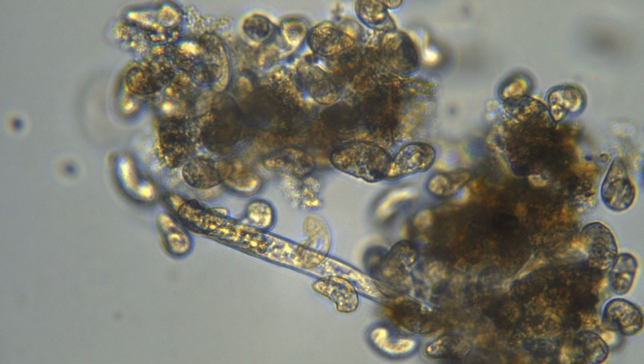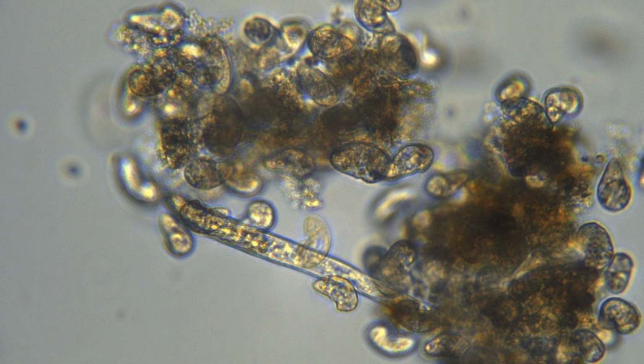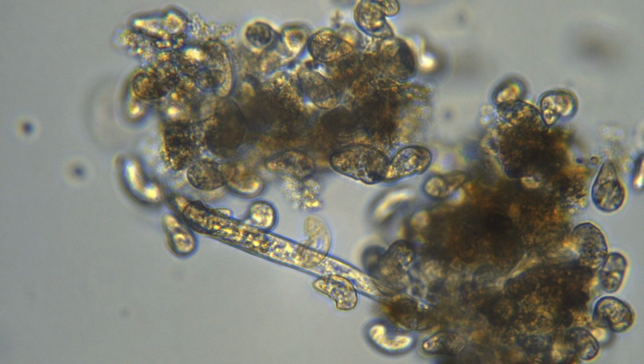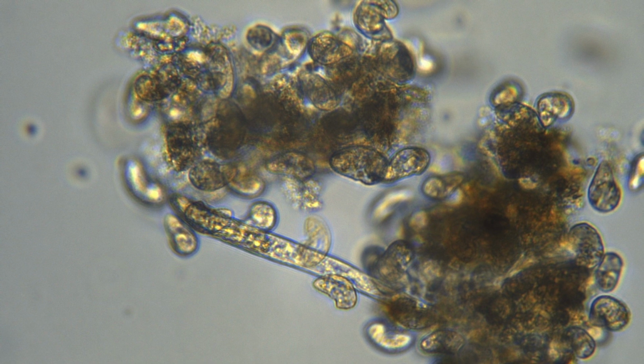And what we have going on here, this organic matter is absolutely swamped with a type of protozoa called ciliates, and also mixed up along this, you can see the straw-like shape just at the bottom of the clumps of organic matter.